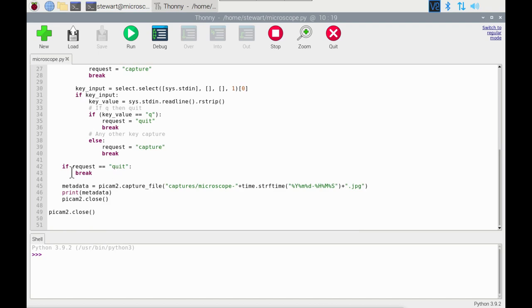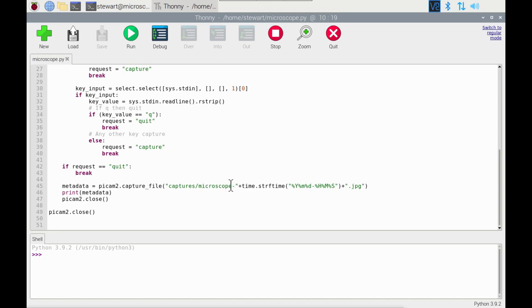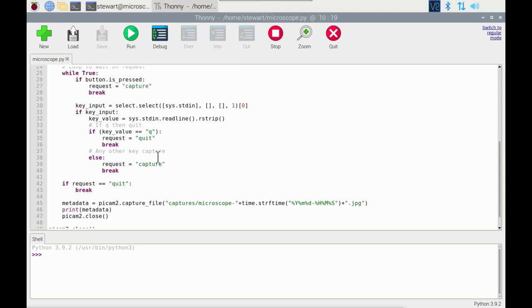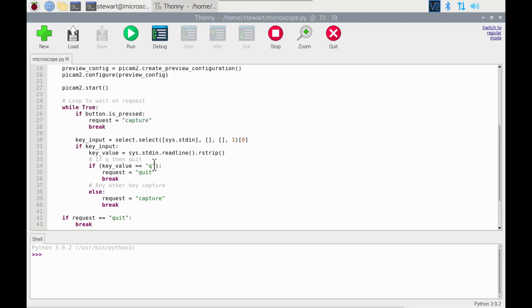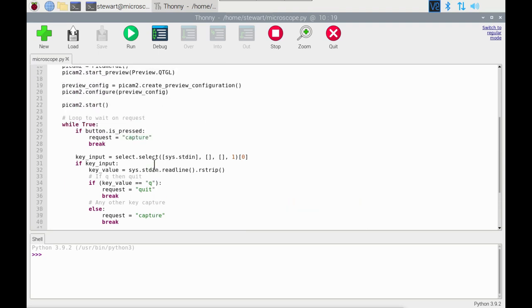If the request is to quit the application then it just breaks out that loop and closes. But if not then it runs this capture. It captures to a directory which I've created in advance called captures and calls it microscope followed by a timestamp based around the year, month, day, hour, minutes and seconds.jpeg file, and then it repeats.